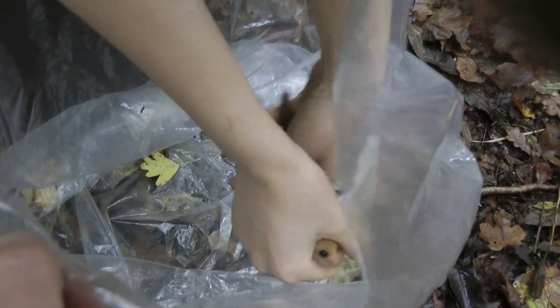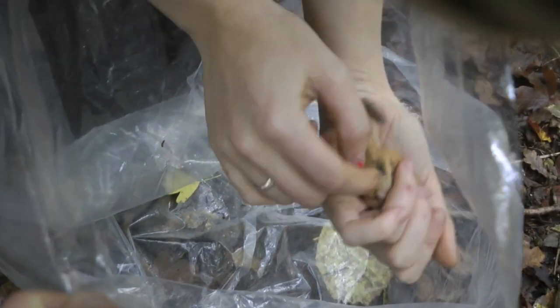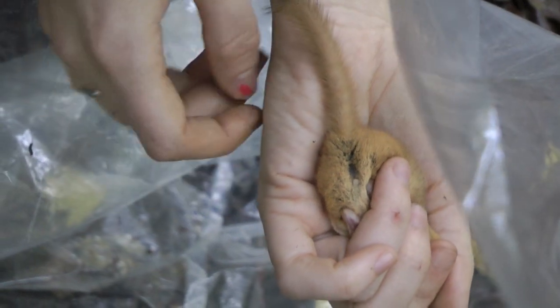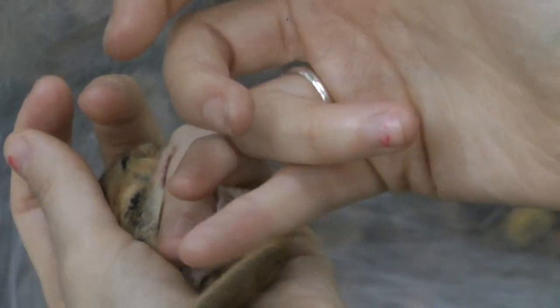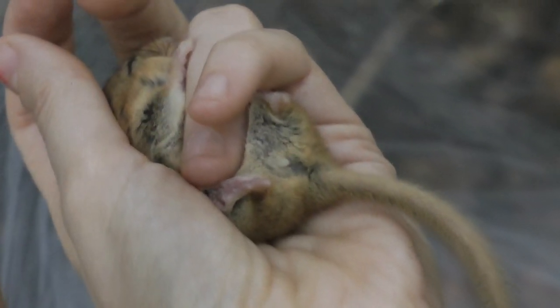Hold the dormouse in a loose fist and then let the animal run between your hands until you get into a suitable position to sex. This should be so the animal is on its back in the palm of your hand with its nose and eyes covered by your fingers or thumb. Ideally the rump of the dormouse should be over the inside of your palm so as you roll the tail away the sex organs are easier to see.